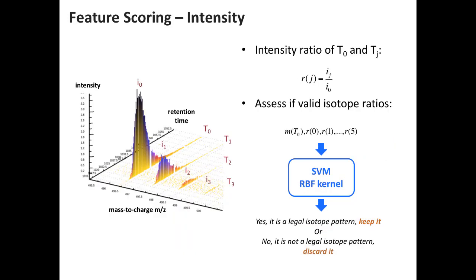It then integrates that, so we put in the intensity ratios that we have from the mass traces and ask the support vector machine, does that look like a metabolite or not? And since it has seen all these possible combinations of isotope intensity ratios, it can more or less confidently say, yeah, this looks like something. Even though the ratio might be weird and you wouldn't expect it, it might have seen that in the data set already.